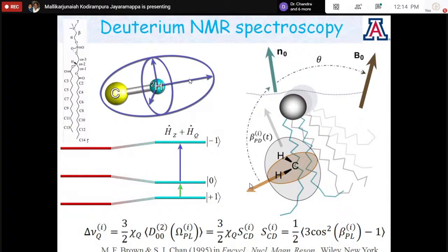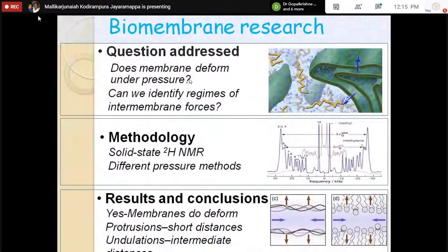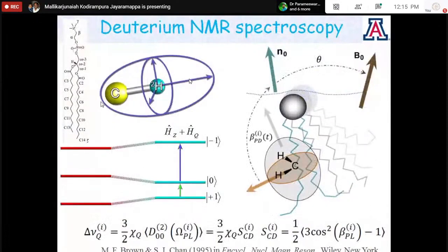And now, for biological systems, let us try to understand what I have presented in this slide. It looks a little complicated. Please give me 1 or 2 minutes. I will try to dig it out one after the other. What we are doing is, for example, if I want to do NMR of this entire lipid, what I have shown on the left-hand side, what would happen? I will get an NMR signal for hydrogen present throughout the material. I think all of you are able to see that the entire big molecule contains hydrogens at every corner. Every functional group has hydrogen.